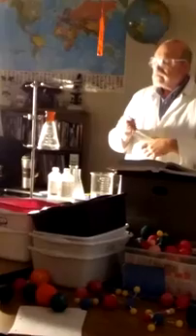All right, so here's the magnesium. It's an element. We've got many, many magnesium atoms, and we are going to back up your story. No, it's hydrogen gas, not poisonous.